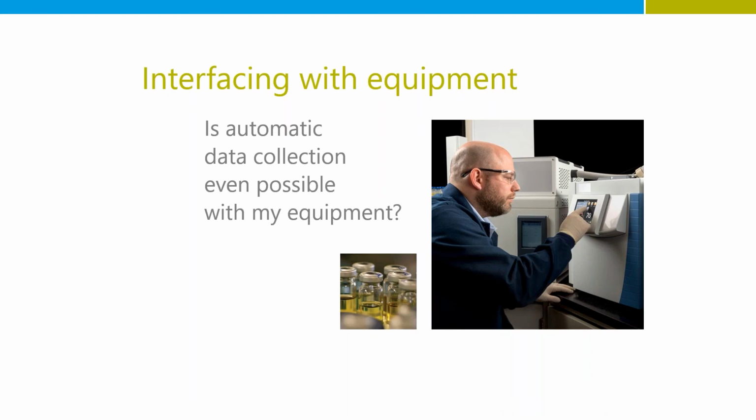There might not be, but it helps to reach out to the manufacturer of the equipment and see what your options are. And feel free to go beyond the manual. Ask for help, reach out to people, reach out to other laboratories that might have similar equipment and say, hey, I need to make this more autonomous. What can I do here? And hopefully that'll help you moving forward.